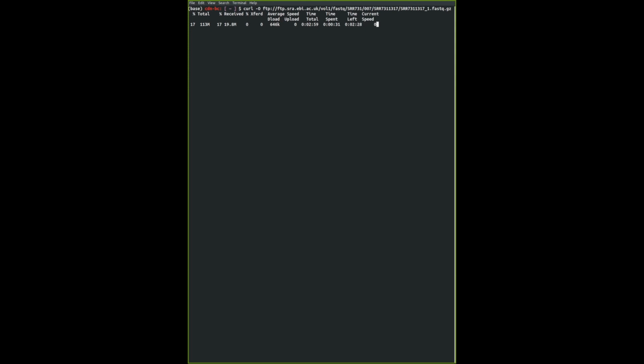So as mentioned, you sometimes will get paired end sequencing data, as you can see here. Sometimes you get single end sequencing. It doesn't really matter. Of course, paired end is slightly better because you have more information, you have more reads coming from your experiment. That means that you can have better coverage or better depth of your sequencing.